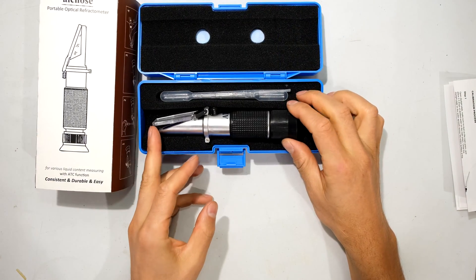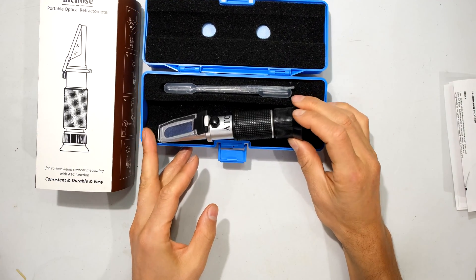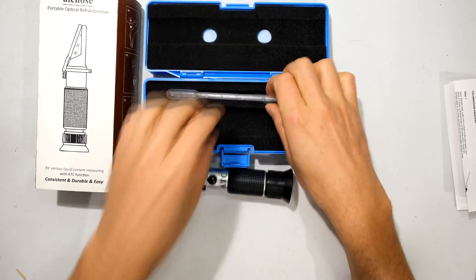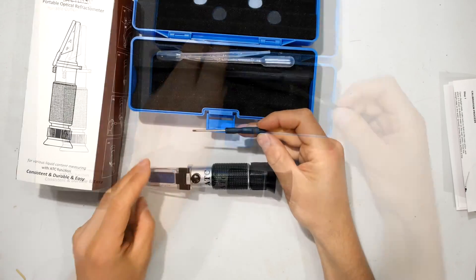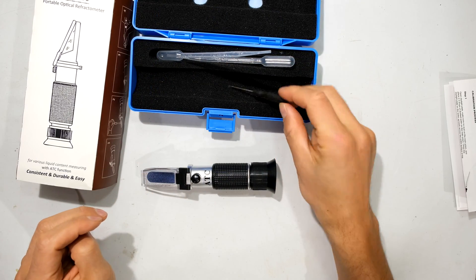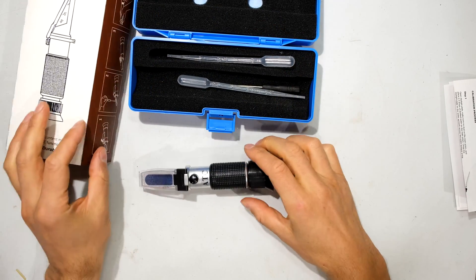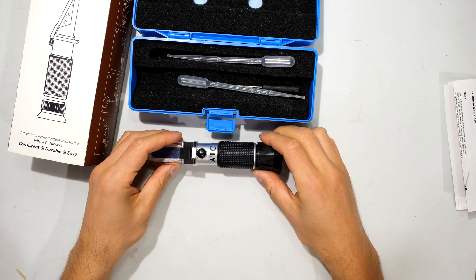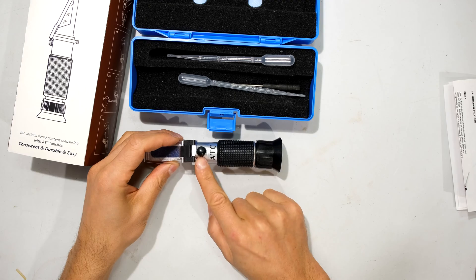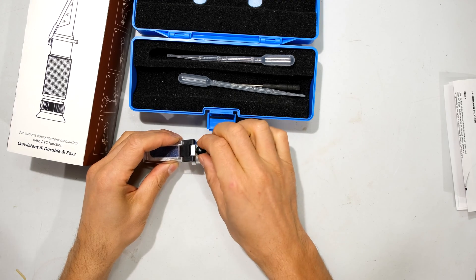Right, here is the refractometer. It comes with this little screwdriver. There's your dropper. And the calibration knob is sitting over here.